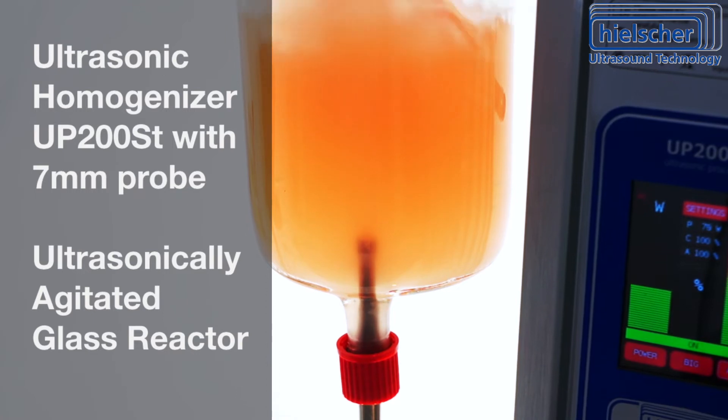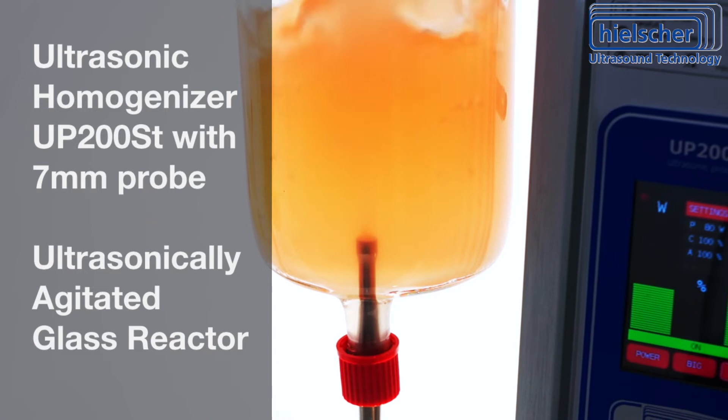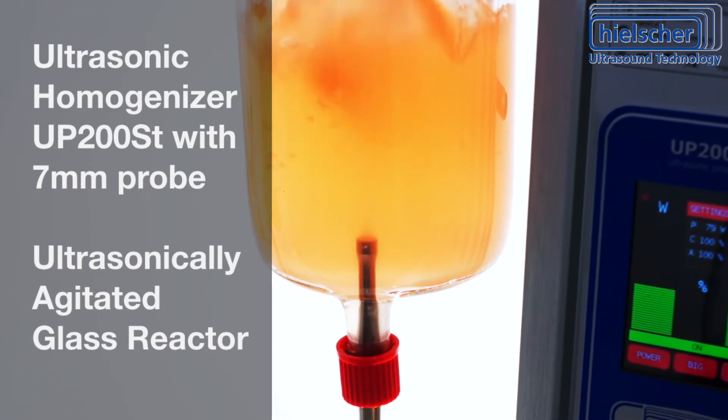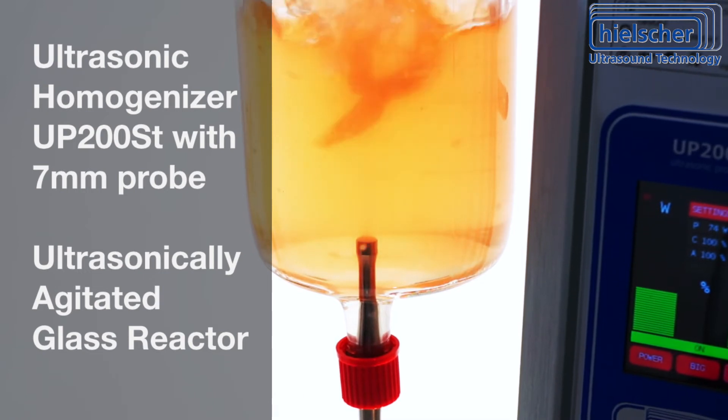Multiple ultrasonic probes can be mounted to one reactor vessel, for example at different heights. Often, the installation from the side or from the bottom is preferred, because it works better with varying liquid levels.